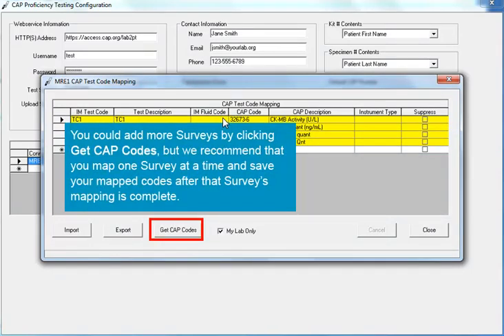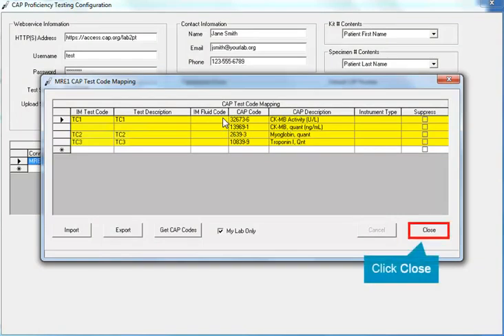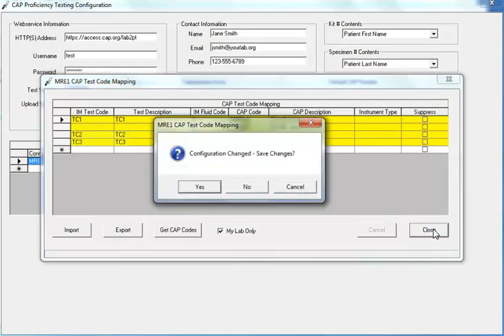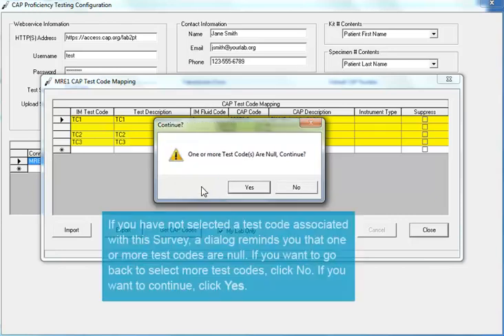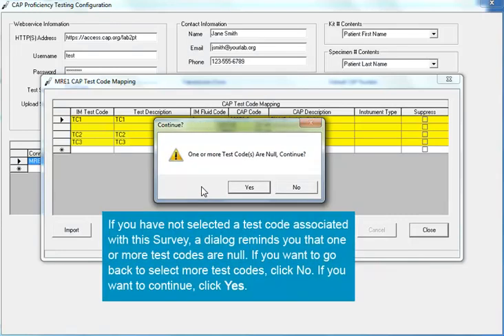You could add more surveys by clicking the Get CAP Codes button, but we recommend that you map one survey at a time and save your mapped codes after that survey's mapping is complete. To save your mapped codes, click the Close button. A pop-up dialog asks you if you want to save your changes — click Yes. If you have not selected a test code associated with this survey, a dialog reminds you that one or more test codes are null. If you want to go back to select more test codes, click No. If you want to continue, click Yes.